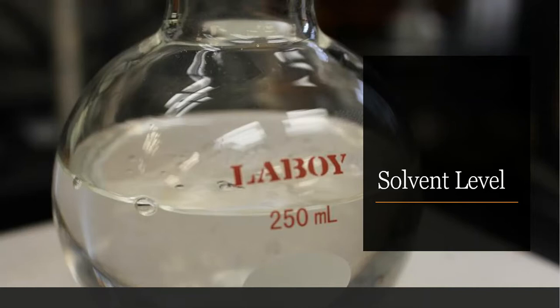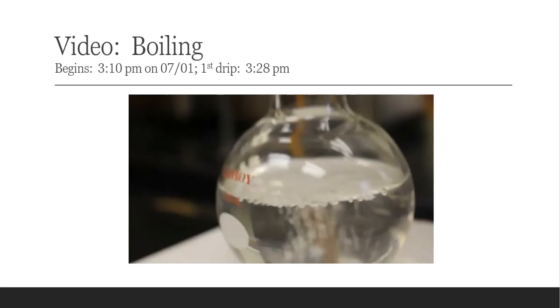All right, so there's the solvent level. I told you in the video how much I probably used, estimated, and then I crank the heat on. So we need to heat this solvent up, right? We need to turn it to a vapor. We need to have it go up and over and drip down into the Soxhlet. And that's what we're going to see here.